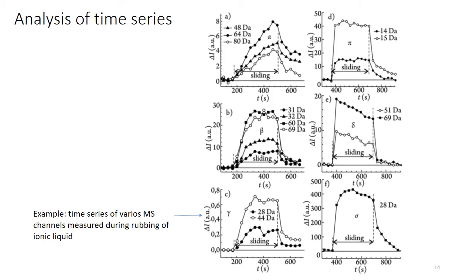In many cases, the mass spectrum of triboemitted gases is so complex that it is very difficult to analyze. This is especially the case for polyethylene glycol compounds, which produce a number of different products with very similar ionization mass spectra.